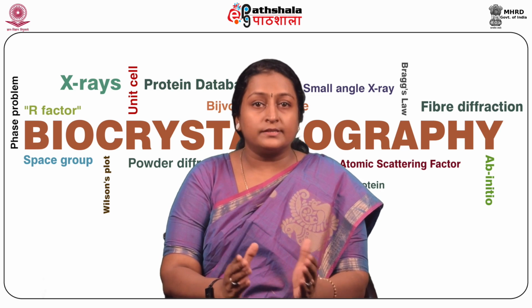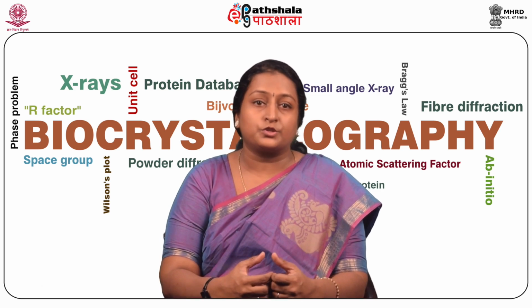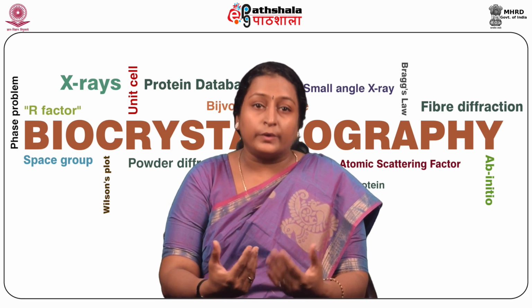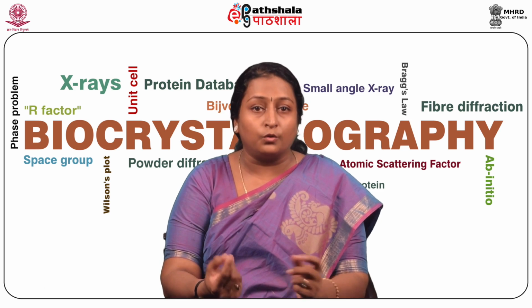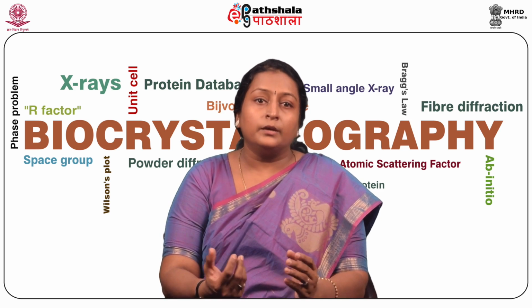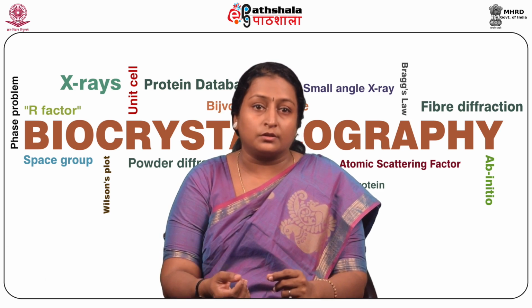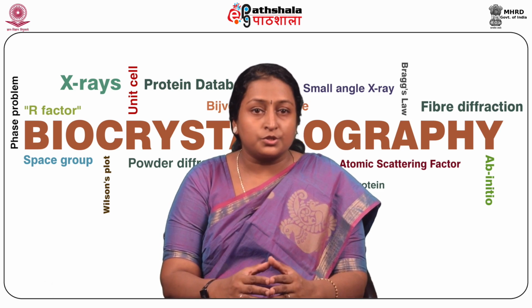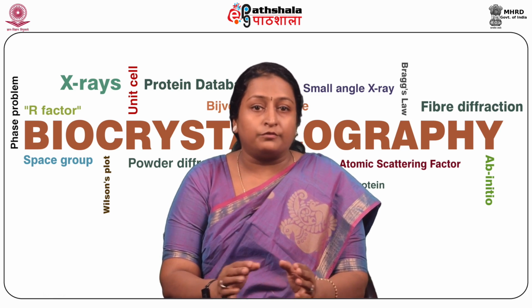Moving on to the strengths and limitations of X-ray powder diffraction, let's see what the strengths are. It is a very powerful and rapid technique for identification of unknown materials. In most cases, it provides an unambiguous mineral determination. Minimal sample preparation is required. Data interpretation is relatively straightforward.